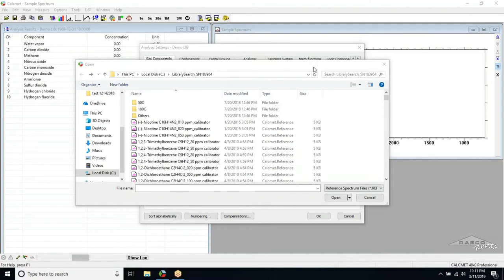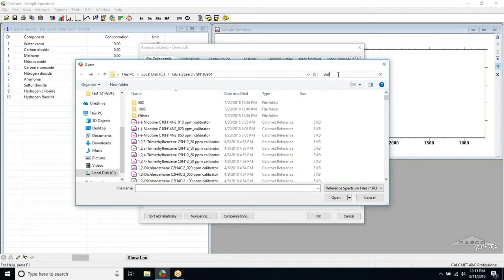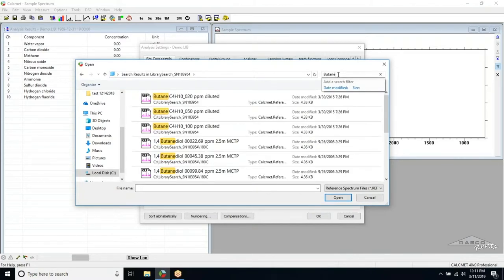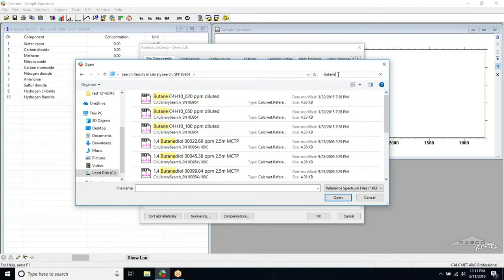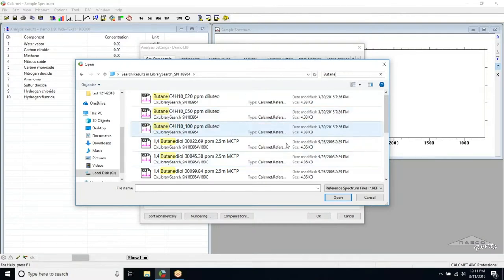For this example, we are going to add butane to the library. To find the reference spectra, we can either manually search through the folder, or we can use the search bar in the upper right corner of the search window. Many gases have very similar names or contain the name of another gas within their name. It is very important to select only the reference spectra files for the exact gas you are looking for, so this is just something to be aware of when performing this step.